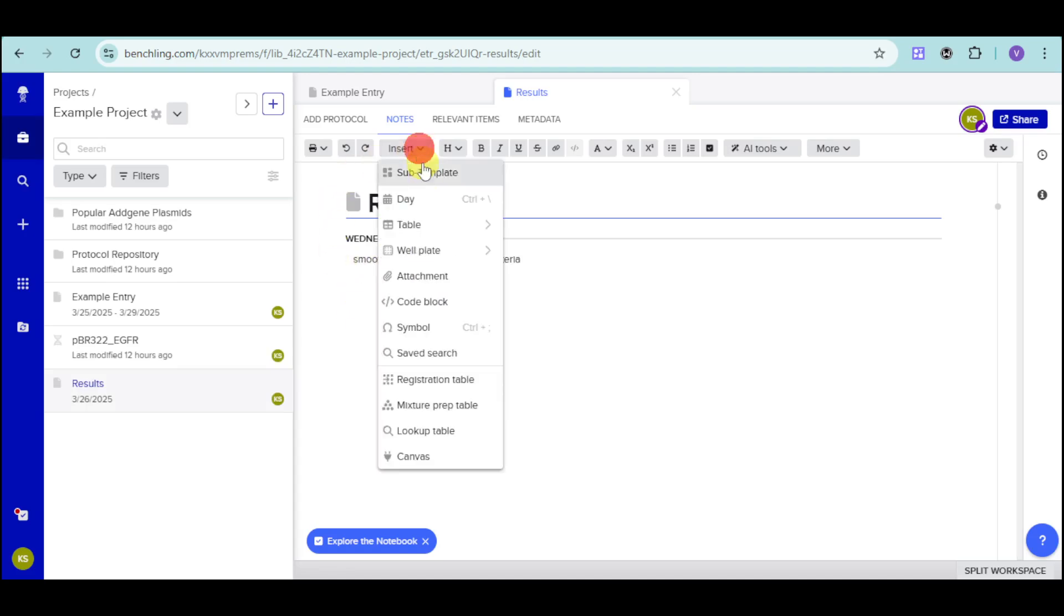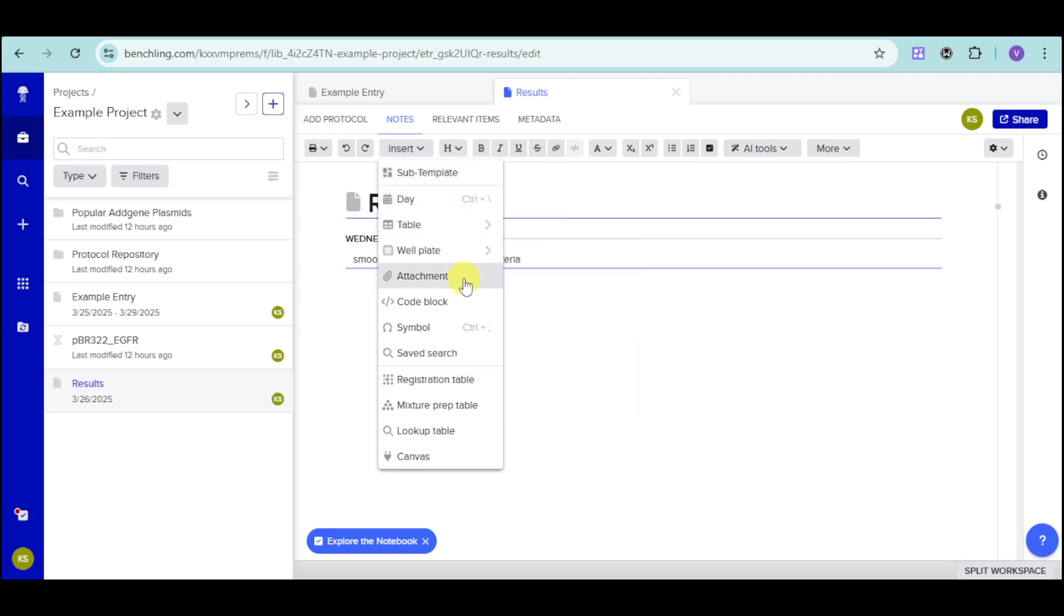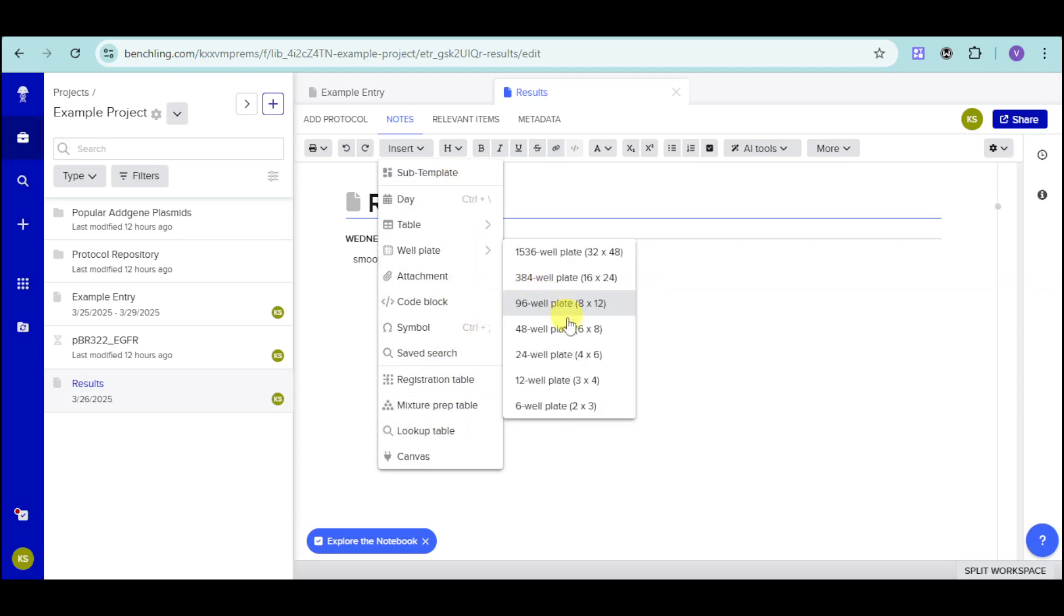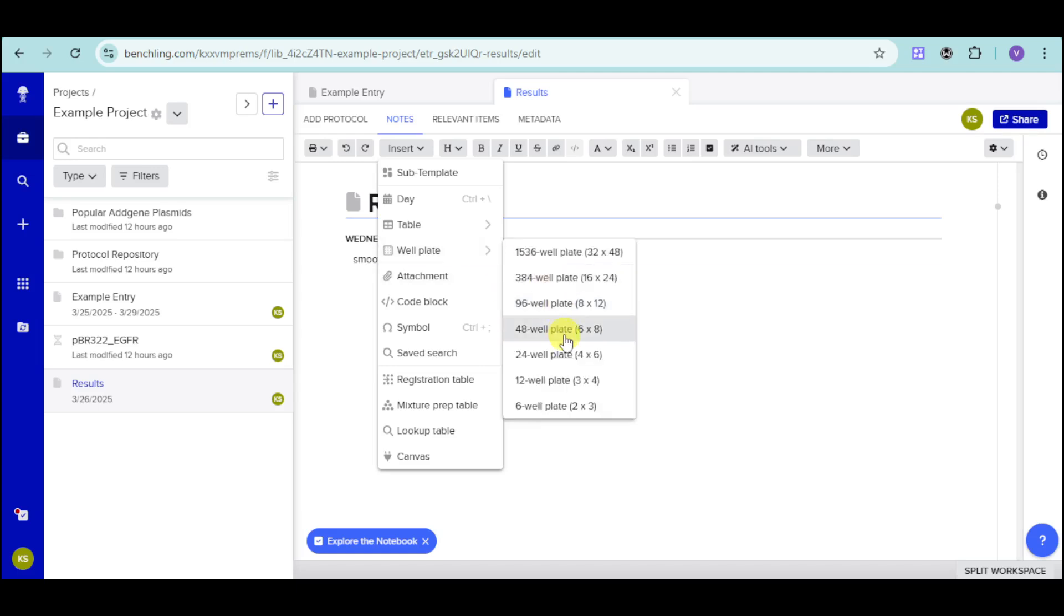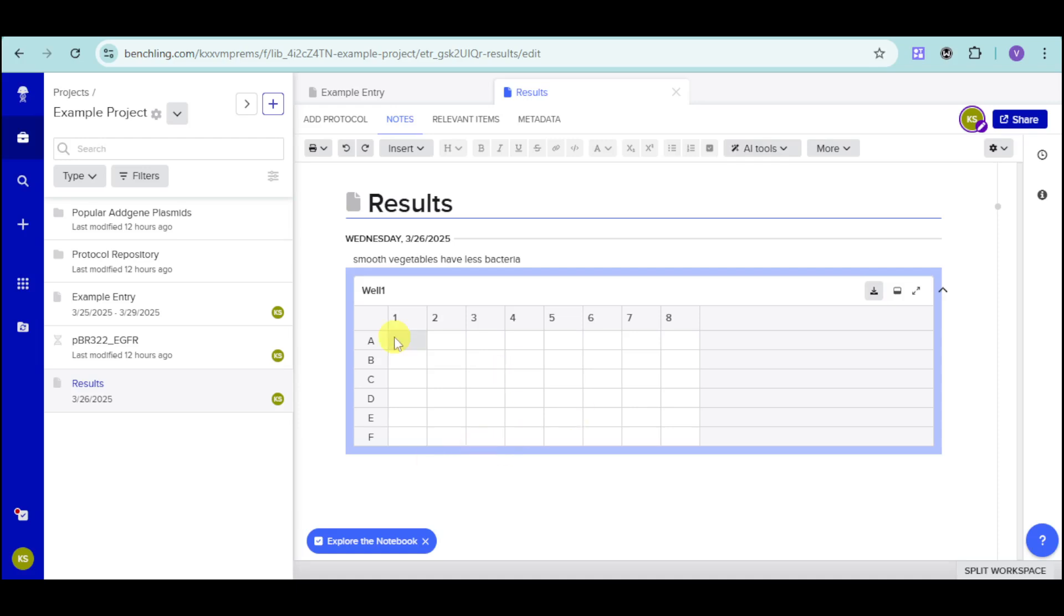You can edit it however you want. You can insert in here some subtemplates, tables, days, wall plate, attachment, code blocks, and the likes. Let's see in here a wall plate. For example, let's choose in here this one. And in here, you can see this. It's like a Google Sheet of a particular template. You can input in here data based on that.